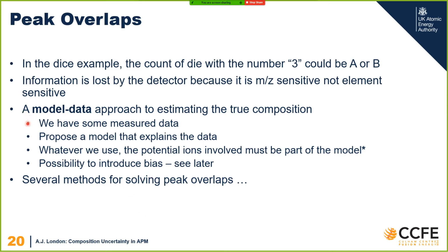What I'm going to present is a model-based data approach to estimating the true composition. This is where the maximum likelihood comes in.